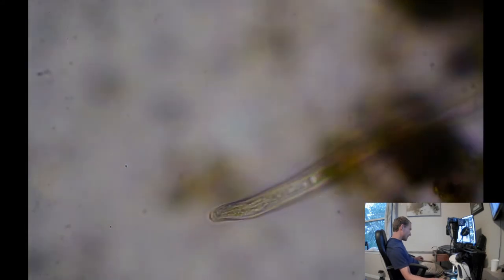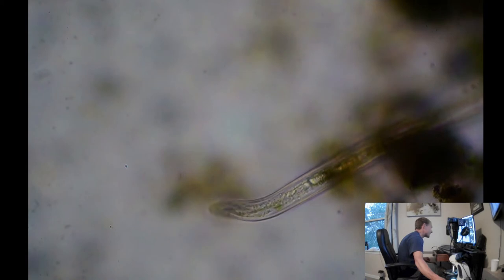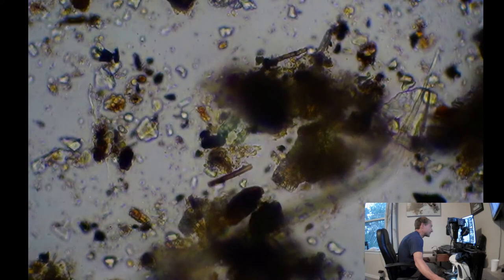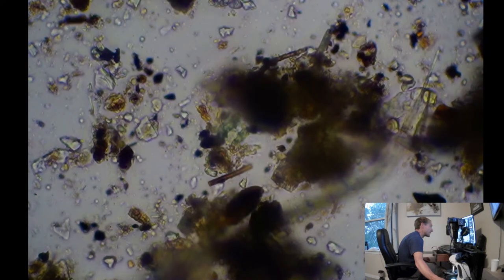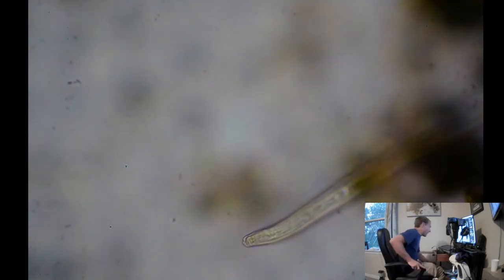Is that your tail or your mouth? It's a big nematode. Yep, well, that's his tail, for sure. Yeah, way too skinny to be his mouth up there. This may be a predator nematode. No spike in his head. It's very, very large.